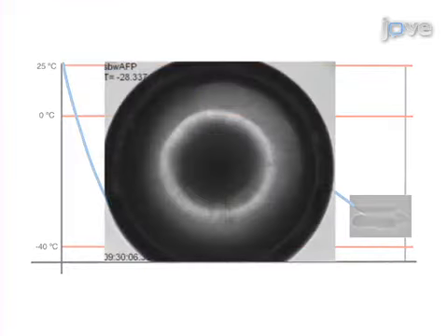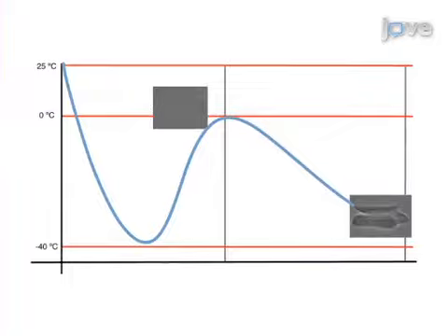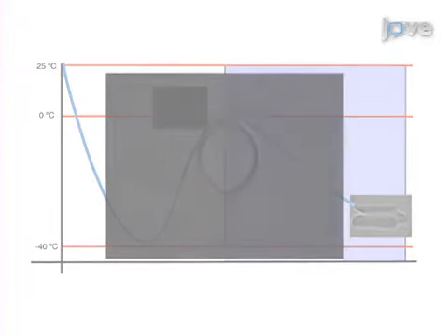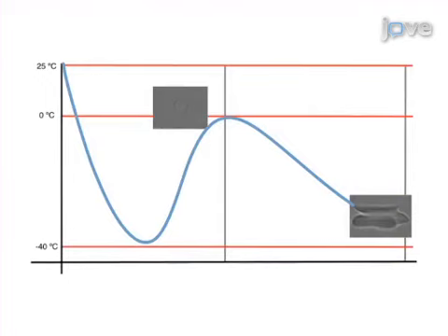The final step is to cool the ice again until it starts to grow rapidly. Ultimately, video microscopy analysis is used to calculate the difference between melting temperature and freezing temperature for thermal hysteresis determination.